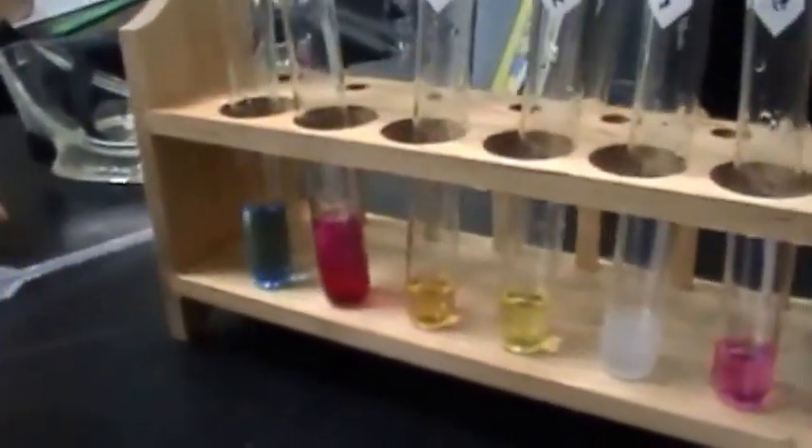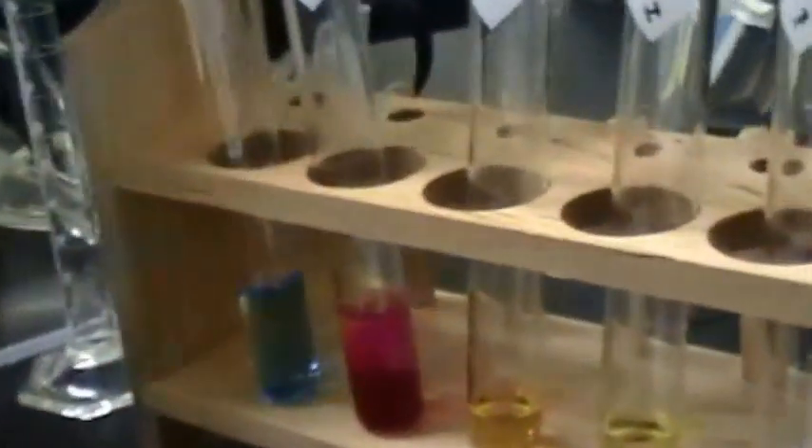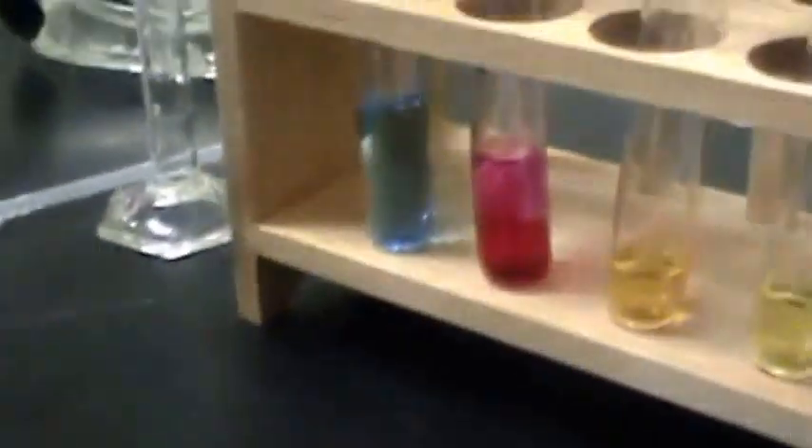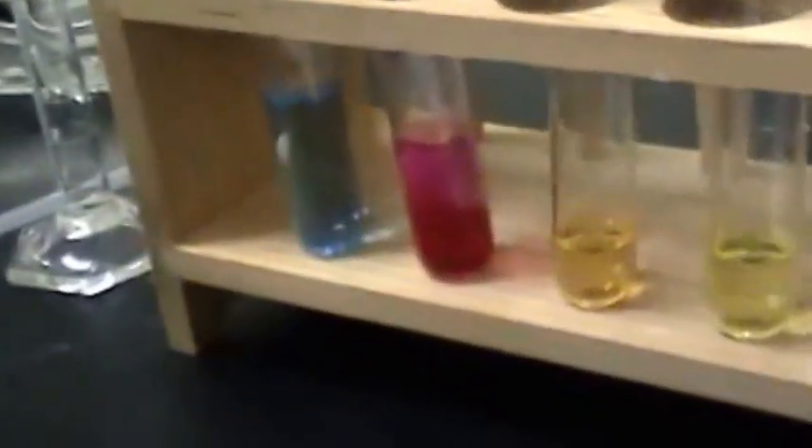Third ml later with bromothymol blue — let's see if it settles. It just got lighter, then back to blue. Now we're doing our third for phenolphthalein. It doesn't go away — almost red.